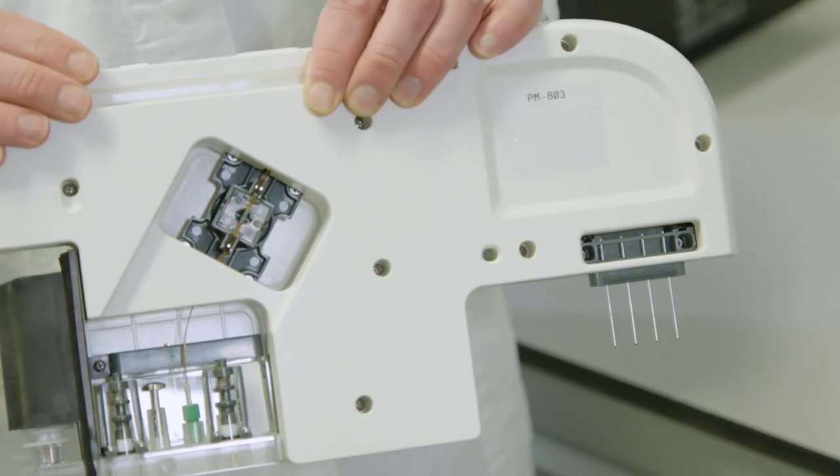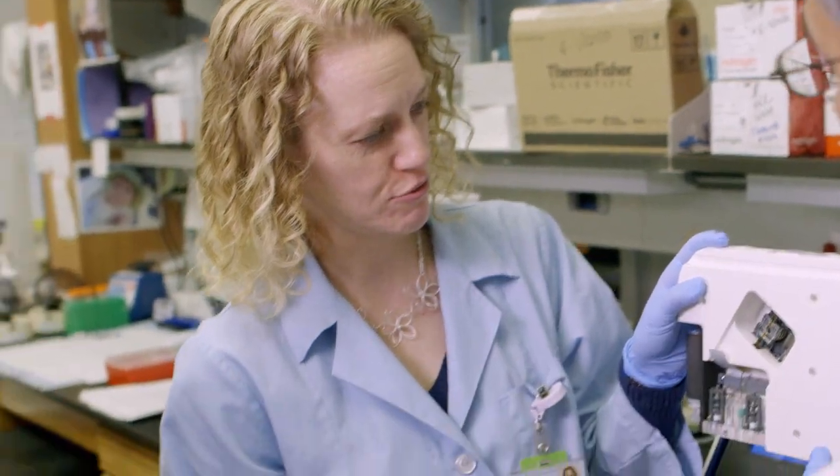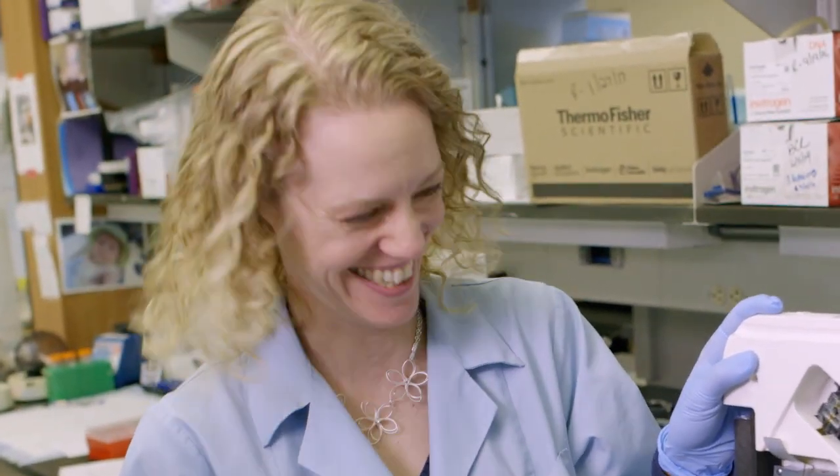Amazing. I love that it fits on the lab bench. Fits much better in any lab, I think. And this is a new cartridge. Everything you need is included. You just slide it right in. Easy.